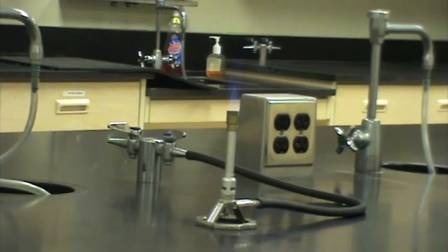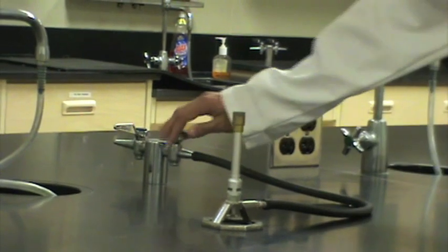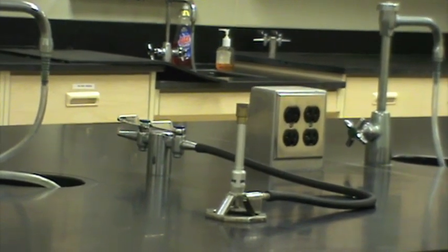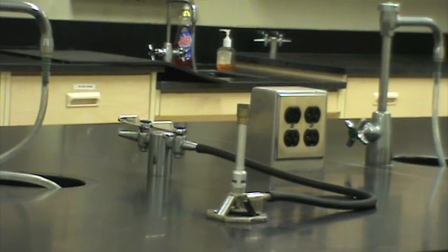If at any time the flame in your Bunsen burner goes out, immediately shut off the gas. You never want to try to relight the flame. It is always better and safer to start from the beginning.